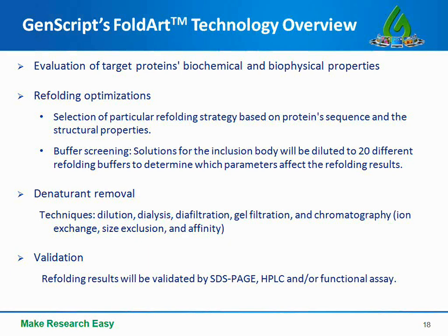Regarding denaturant removal, five different techniques, dilution, dialysis, diafiltration, gel filtration, and chromatography, will be employed to remove the denaturant. Refolding results will be validated by SDS-PAGE, HPLC, and functional assays.